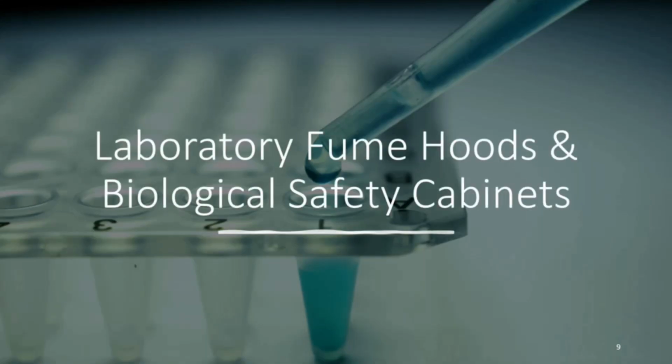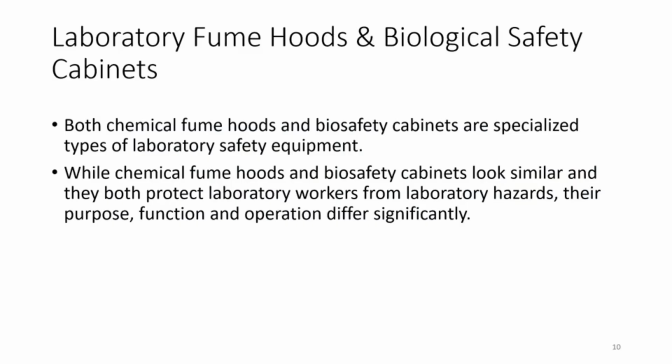Okay, in this section of the video, we are going to look at some of the common laboratory safety equipment, namely the laboratory fume hoods and the biological safety cabinets. The chemical fume hoods and biosafety cabinets may look a bit similar in appearance. Both of them will protect the laboratory workers, which is you, from the laboratory hazards during experiments. However, the purpose, function, and operation differ quite significantly. I will explain about these two equipment in the subsequent slides.